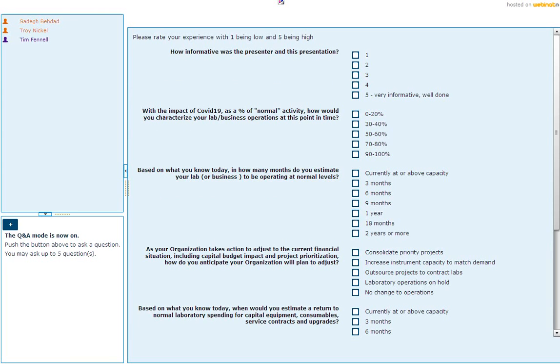That's a very good question. The main improvement of testing in an ElectroForce instrument compared to a traditional one is that you can monitor your viscoelastic data and how they change with time in a heat buildup test. So at any given point, you can measure your modulus and your tan delta. And also, you can have perfect monitoring of load and displacement and stiffness with time, looking at your hysteresis data and how they change. So that's one.